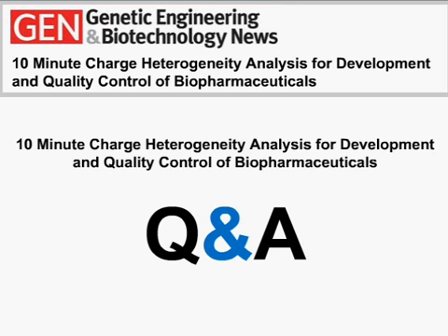So we are slightly overestimating the higher conjugated species. So the drug-to-antibody ratios calculated based on CIEF tend to be slightly off compared to what you get from mass spec, but they are still very comparable. So yes, we have used it, and even though slightly off, they give you a good idea about the drug-to-antibody ratio.